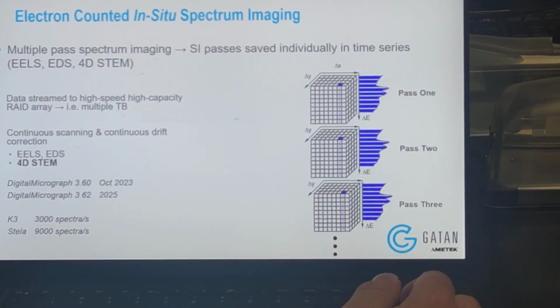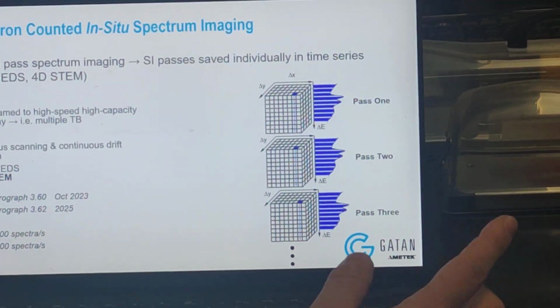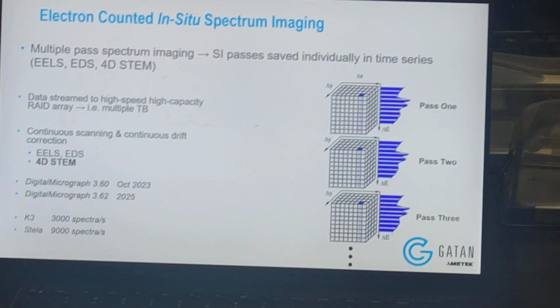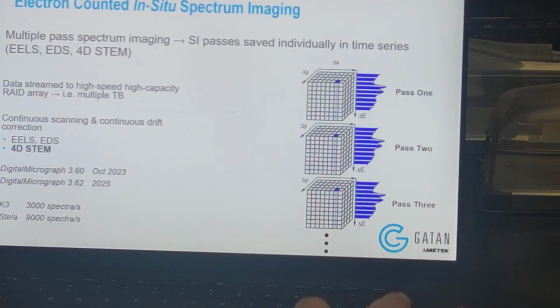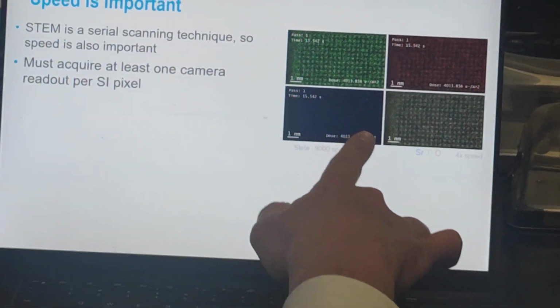But with the Digiscan 3, it's better, but it could be possible to do it with the Digiscan 2. But I think it would be hard to get the same spatial resolution with the DS2 as with the DS3. Okay. I was just showing, there's a few bits of data. Okay. So this is kind of fun.